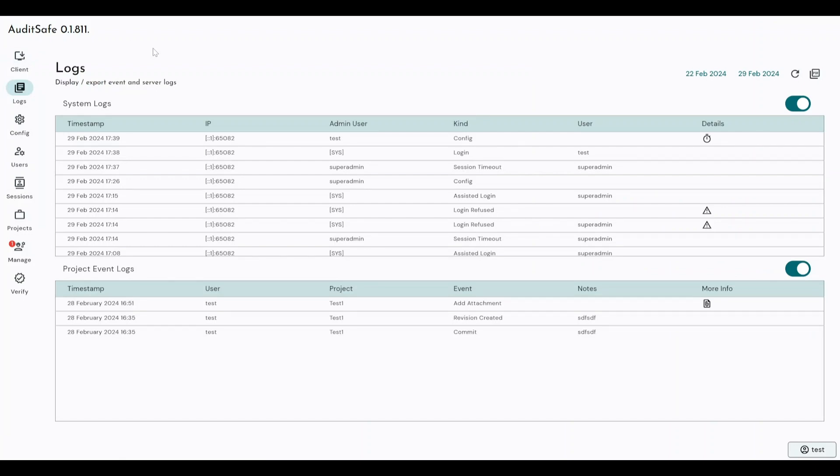Now, as I touched on previously, logs can be centralized. So at the top here, we've got our system logs, which is everything that is done within this tool, this server tool where we configure our users and our secure folder and our permissions and everything like that.